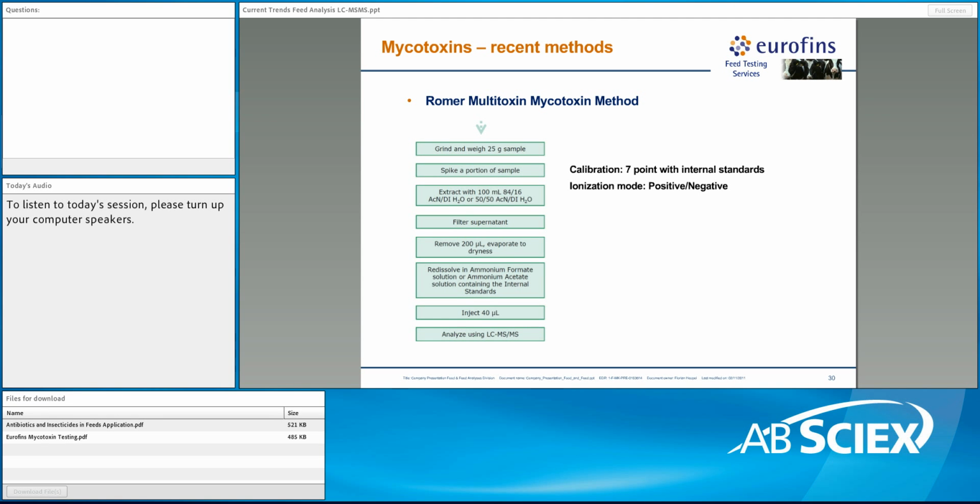method was intended for. And as you can see, the preparation flow chart is very simple and rapid, allowing the use of this method in process control as well as export laboratories where speed of testing is very essential. The flow chart is basically a 5- to 6-step flow chart.